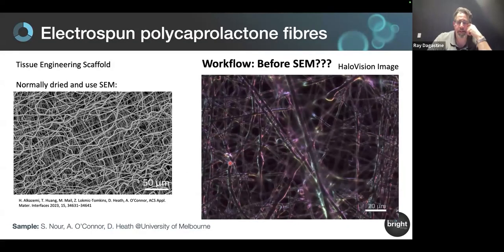And you see a couple of things. First, this is a really thick focal block, and some of it almost looks a little out of focus. You're actually illuminating the whole focal block because that evanescent light wave couples into those fibers, and the fibers effectively work as a light pipe. So you end up illuminating the entire sample, even though the evanescent wave is a small fraction at the bottom. This is a much thicker sample.